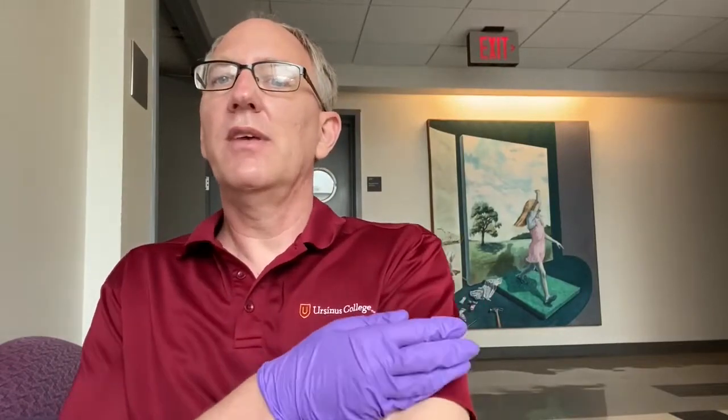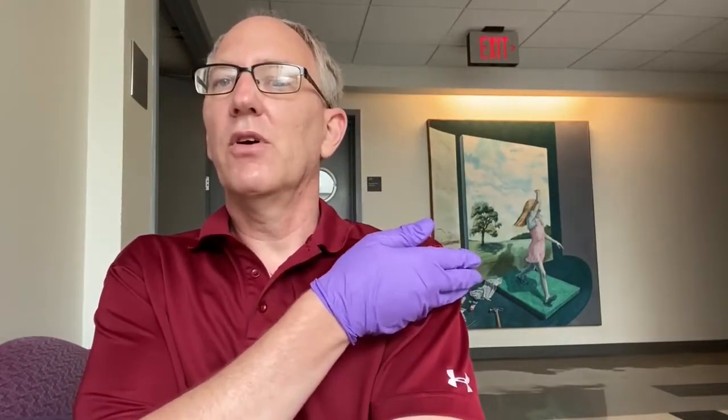In the laboratory space, you must have everything covered, all your skin covered from your torso on down. That means that the tops of your feet must be covered with socks, your ankles must be covered. There will be no short pants, no cutoffs, no belly shirts, no muscle shirts. You have to have sleeves that come down almost to the elbow, not the short ones that come down just over the shoulders. Everything has to be covered or else you'll be sent home to change and asked to return to the lab. And then you may not be able to get all your work done in time.